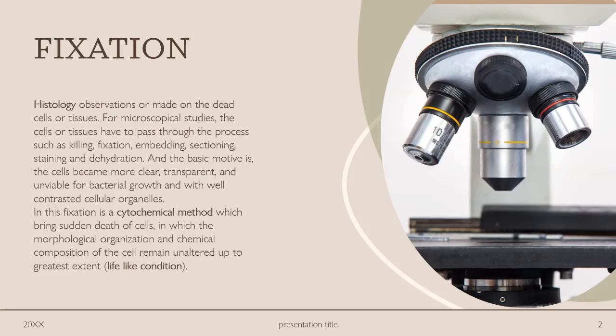Our topic fixation is one of the cytochemical method which brings sudden death of cells, in which the morphological organization and chemical composition of the cell remain unaltered up to greatest extent. Fixation gives lifelike condition, and that's what we want.